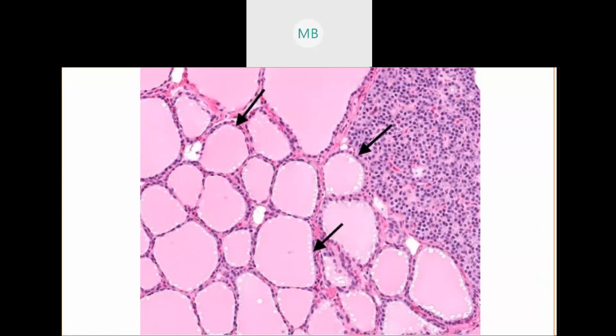The other 2 types of cells that you have to worry about are the cells that line the bubble or are around the follicle, and the cells like these ones where my mouse is right now that don't touch a follicle. These cells do not touch one of the bubbles. So you have cells that touch the bubble and cells that do not touch the bubble.